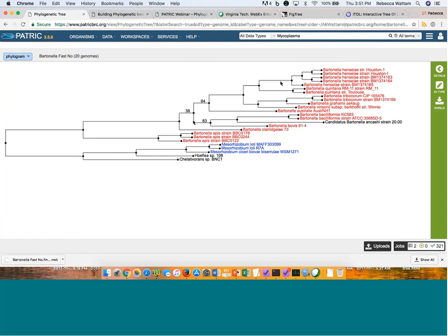But there are a few branches here with less support. So actually it would take this branch with the 38, because the next branch out has 100% support. And so all of these from Claridge all the way up to Hensley would be included for progressive refinement if we had chosen that option.